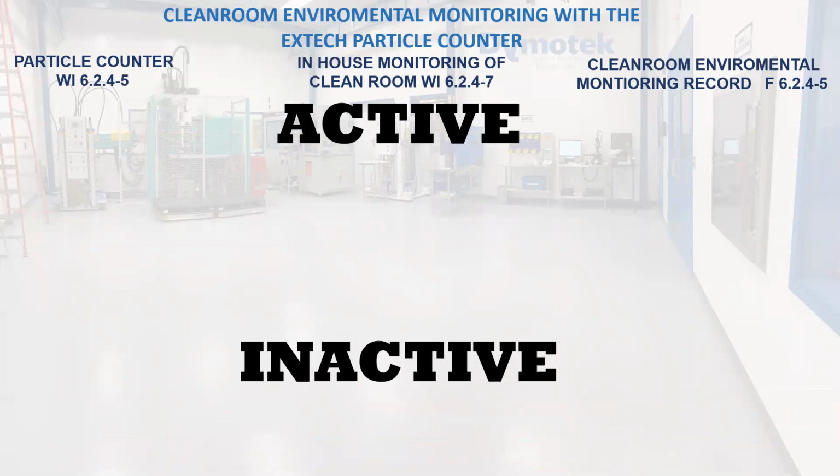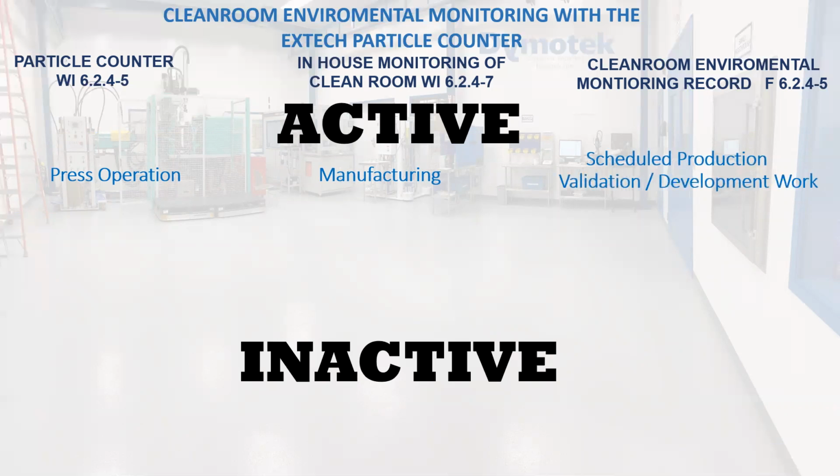So what makes a room active and inactive? The clean room is considered active if there are press operations for manufacturing, which will include scheduled production and validation and development work. Regardless, during validation and development work, if we are making product that is not saleable, the room is still considered active.